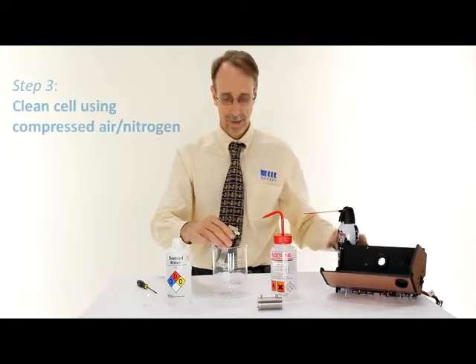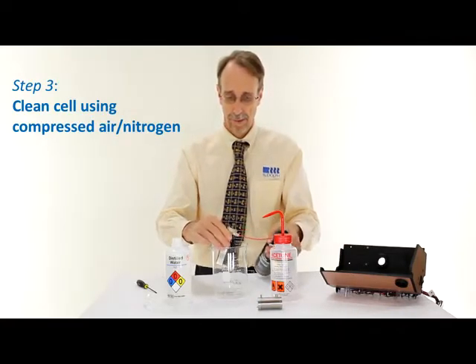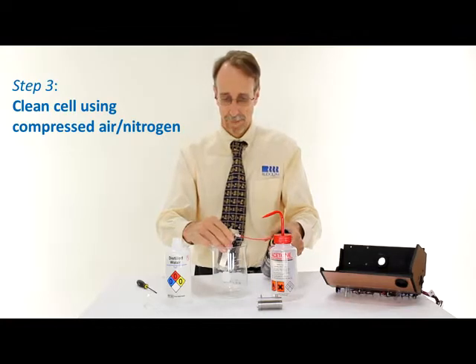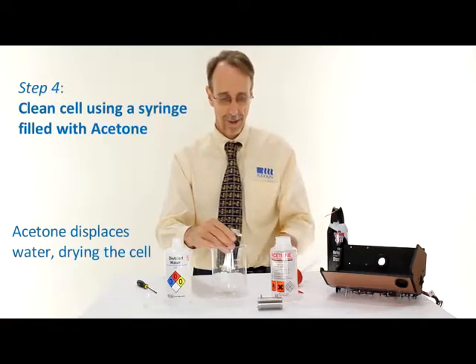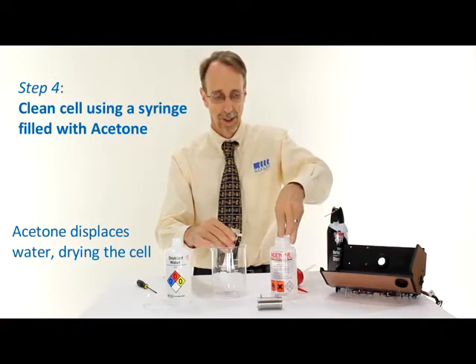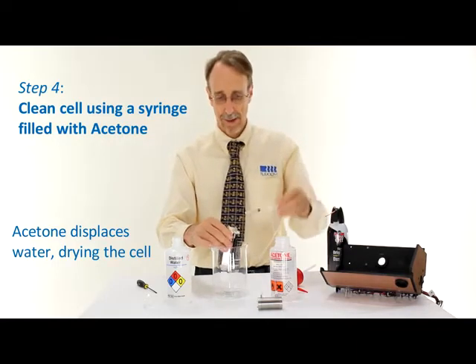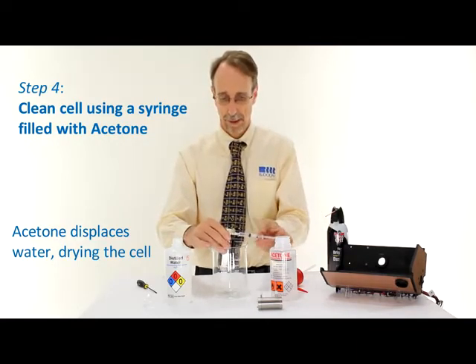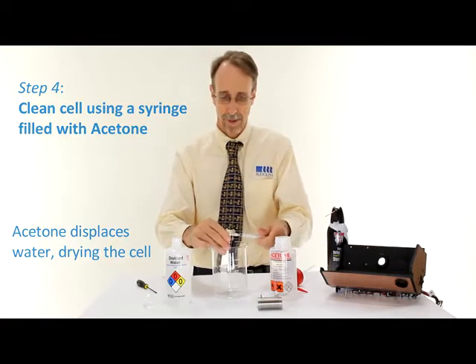Now I'll push the water out using the compressed air. The next step is the acetone. In this case, the acetone is not really acting as a cleaning solvent — it's simply to displace the water and make the cell easier to dry. Suck the acetone in and push through with the acetone, absorbing any moisture.